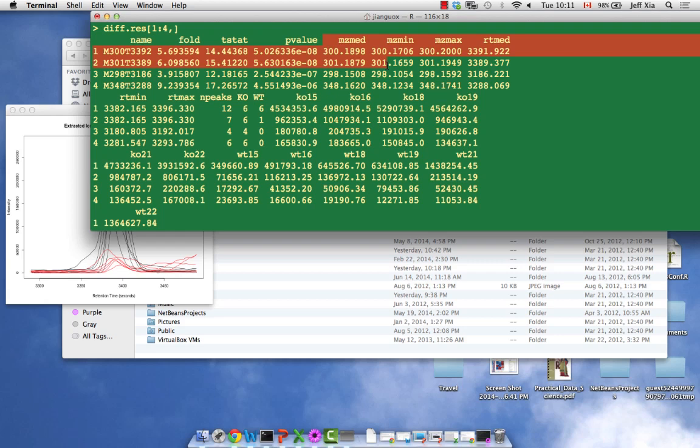So, to concentrate on that second one, you then put in median retention time and the mass? Yeah, you can do that. Basically, we see this, we can really refine our query. We want to see the median retention time and median mass equal to this one. We can do this too. Okay, let's try this. I just need to remember the parameter names, the median m/z equals, okay.